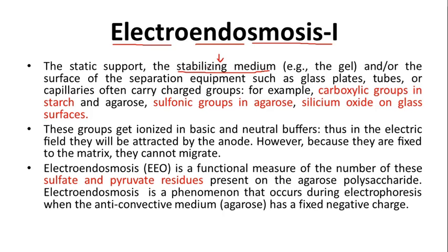A lot of events take place, which is why the stabilizing medium is more important than the buffer, the voltage, and the other parameters. We routinely use a gel.